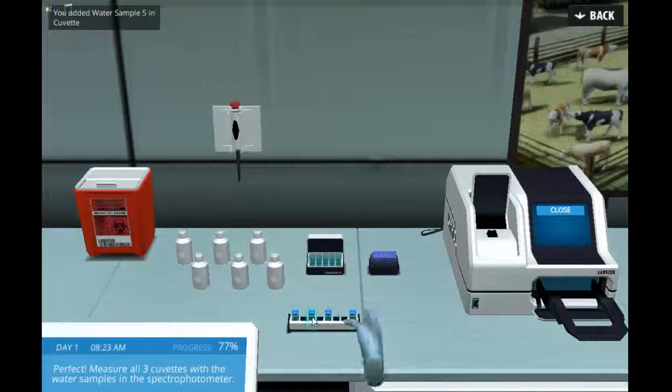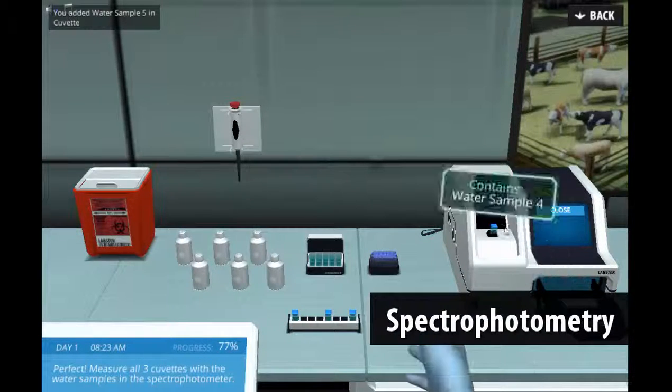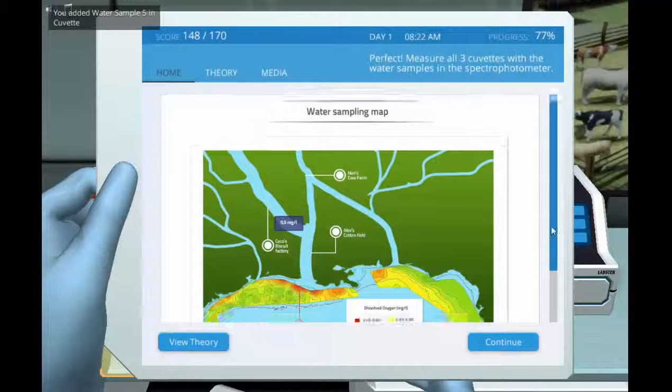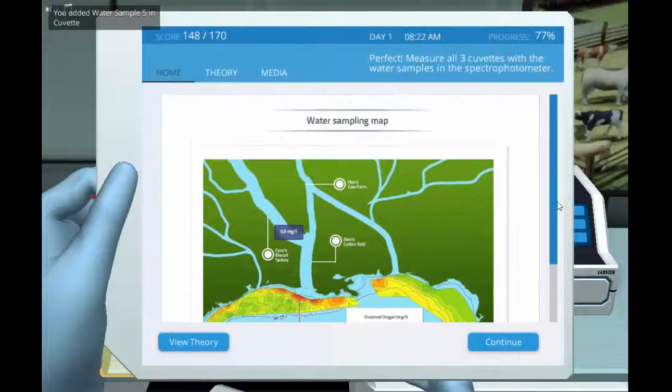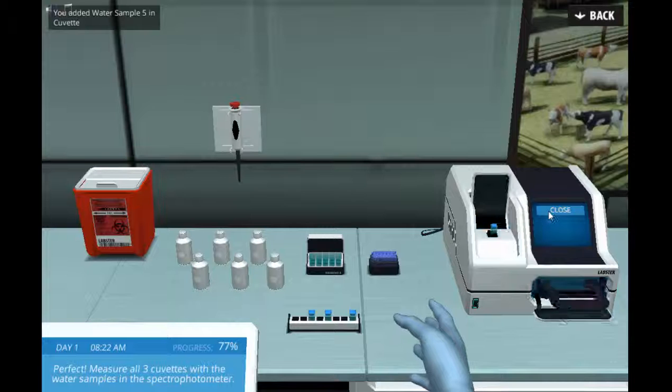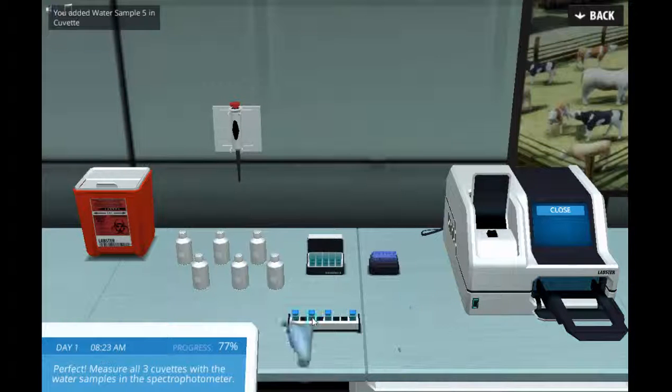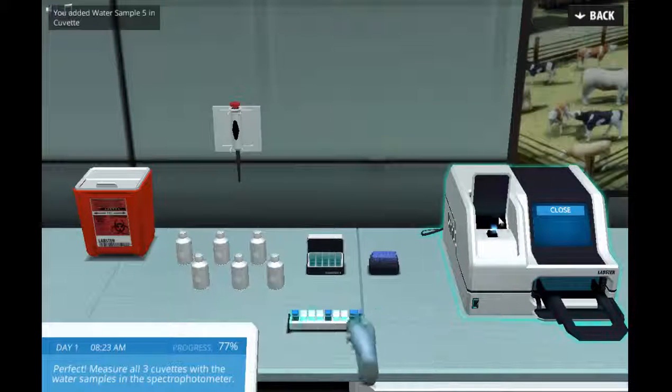They will analyze nitrogen content in the water sample using spectrophotometry. An interactive map will help them determine the source of excessive nitrogen runoff that caused the harmful algal bloom. Will you be able to prevent the massive fish kill?